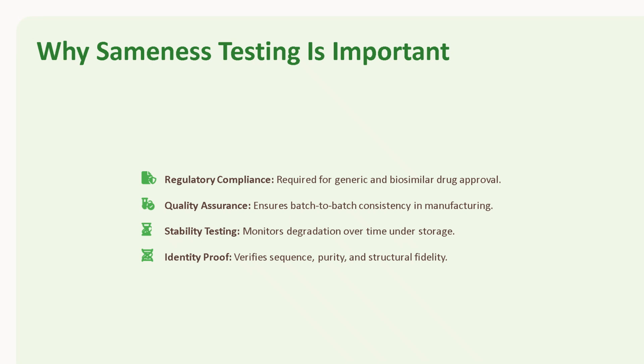Sameness testing also supports quality assurance by ensuring that each production batch is consistent. In addition, it plays an important role in stability testing, where scientists monitor how the peptide changes during storage over time.